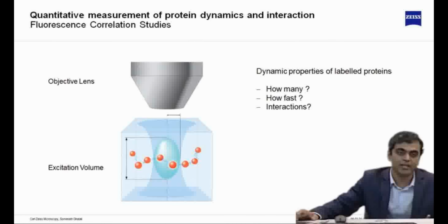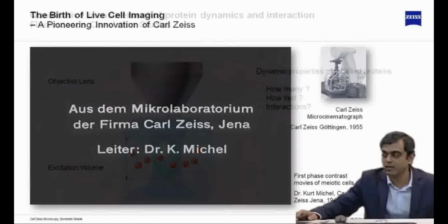And definitely if there are any interactions happening with the interventions you are giving, maybe a drug or any chemical intervention in the middle of your experiment, you can definitely acquire pre and post intervention images.